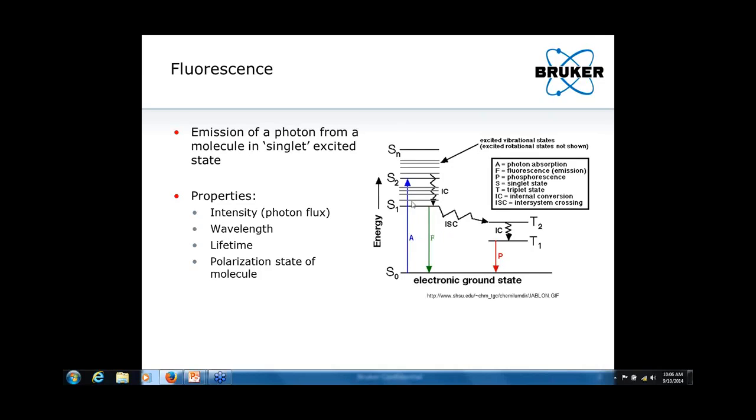So we were talking about fluorescence. Here's where the molecule would receive this certain amount of energy. It will go through the absorption event and go into its excited state. The excited state is not stable, so the molecule would like to go back to the ground state. It will emit a photon after a certain time.